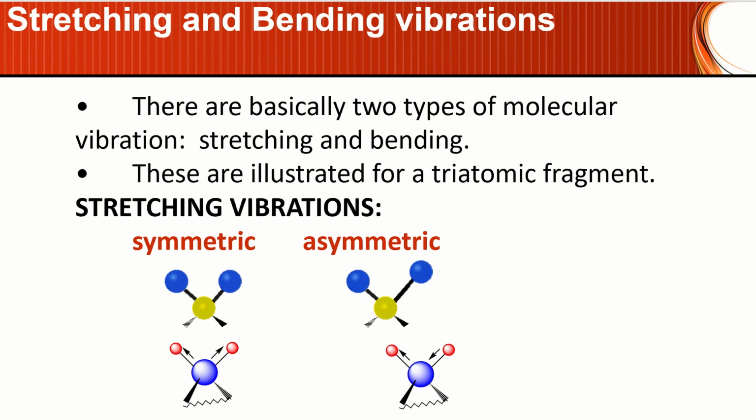So let's look at the stretching vibration first. So we're seeing here the symmetric stretch, and we're seeing our asymmetric stretch here, right? So I have the two images here, two sets of images. They're both saying the same thing. One is an animation and one is not, right?